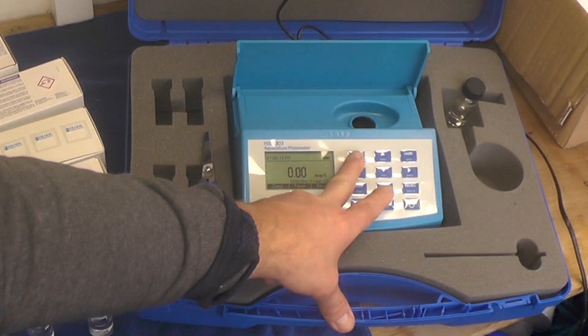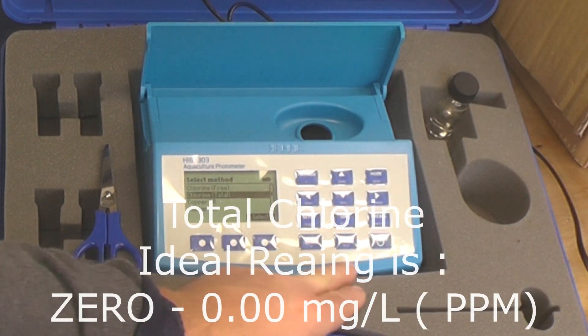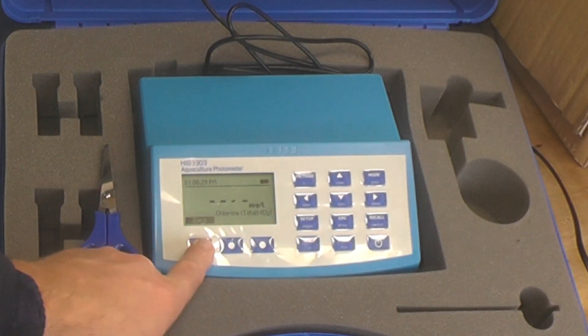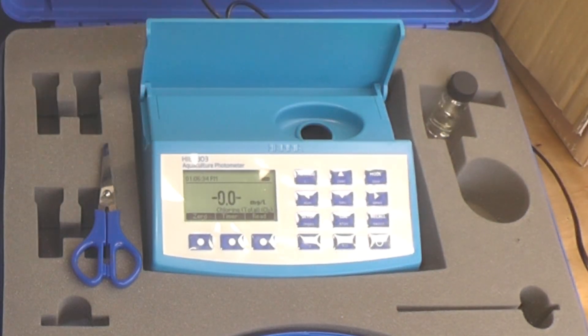The next one we're going to do is the total chlorine. Select total chlorine and zero it.